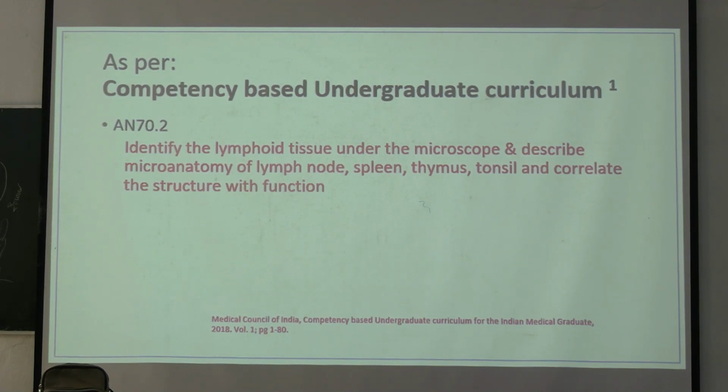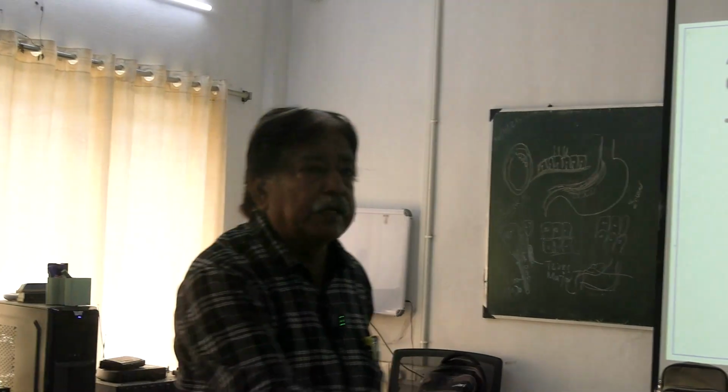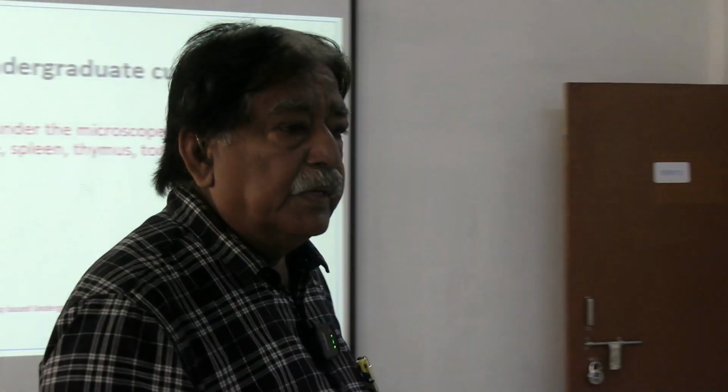You will be given 5 slides. You see, move on, and go to the next. This is the system. Over there, you need not draw. In spotting, you identify whether it's a kidney or a spleen or what type of tissue it might be. You have limited time, so you just identify and give one or two specific structures pertaining to that slide. Am I clear?